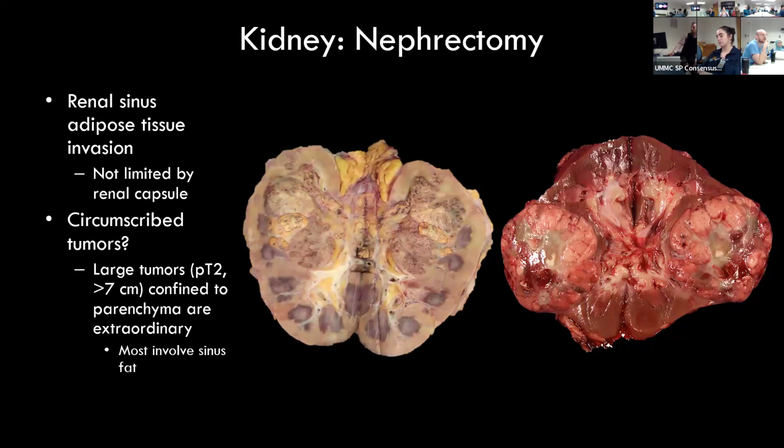Because if you consider it, the renal cortex is maybe only 4 centimeters. The tumor might be able to grow and expand it a little bit, but once it grows beyond 7 centimeters, it's extremely unlikely that it's leaving this area alone.